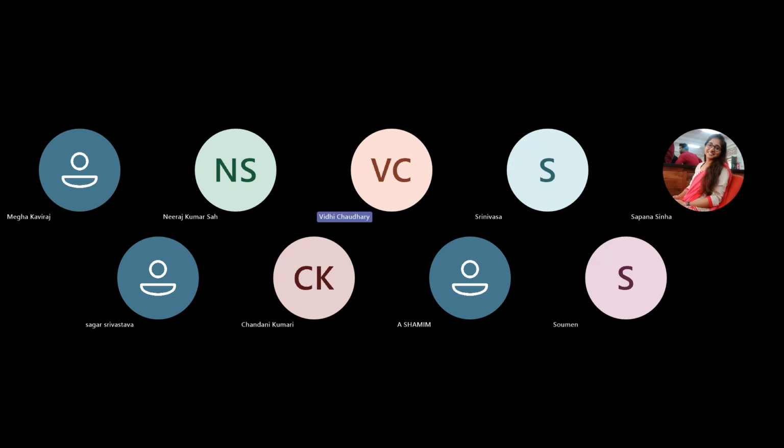Sapna, I think you are asking about some experiment. Yeah, WaterLOGSY can be done in your system.